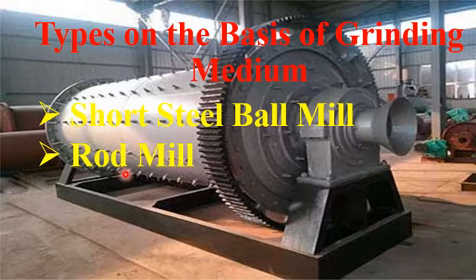And the drawback of the rod mill machines is that they need a longer time to grind the bulk material. The number of bins in the rod mills is usually between 2 to 4, and there are some differences in grinding media loaded in each bin.